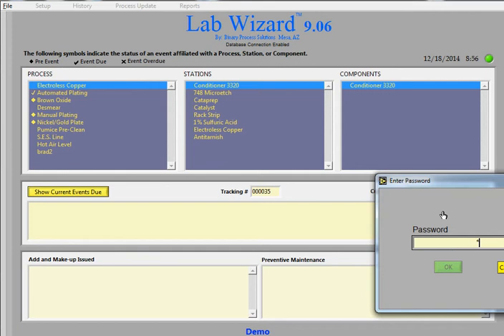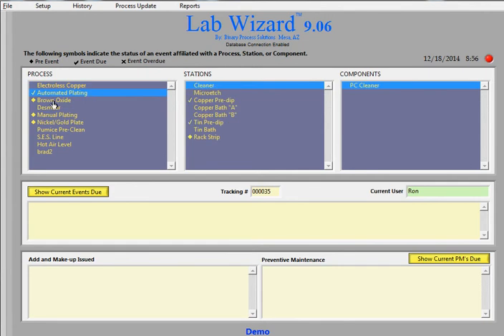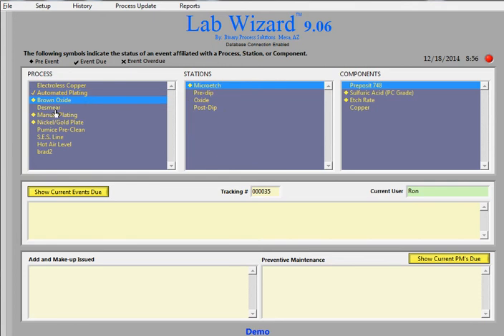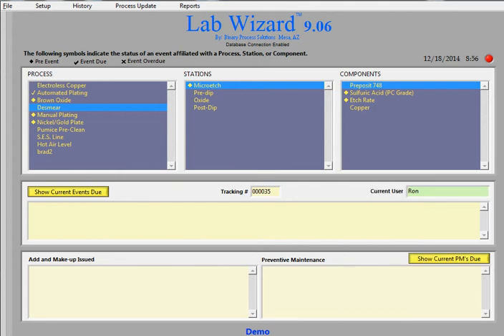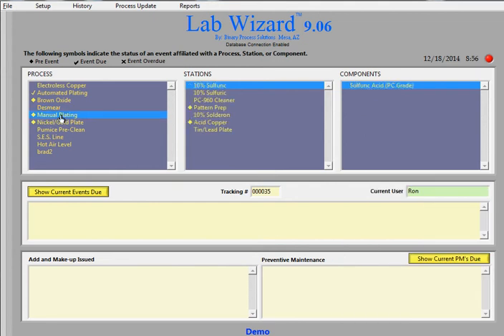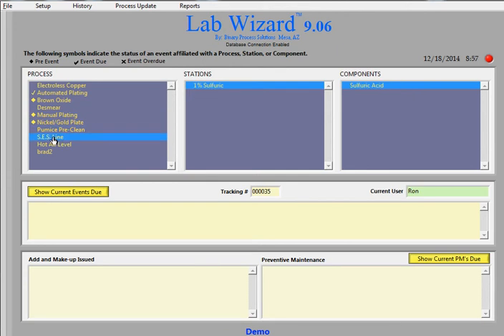So in this case we'll just put in a name, just put in Ron. And right now there's the electroless process, automated plating process, brown oxide, de-smear, manual plating, nickel gold line, pumice pre-clean, SES line, hot air level.